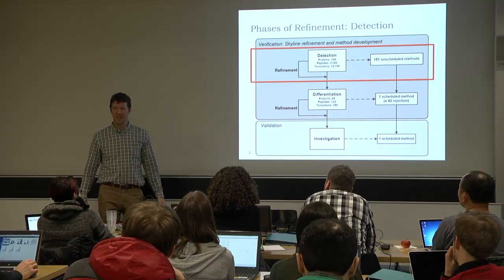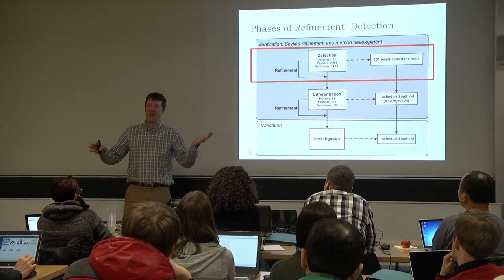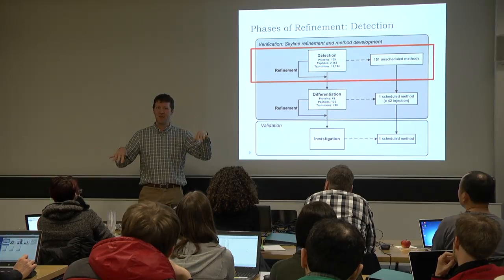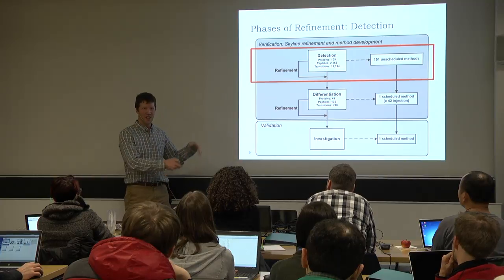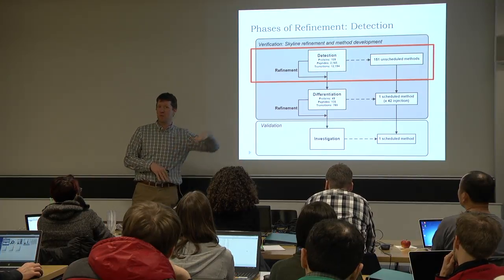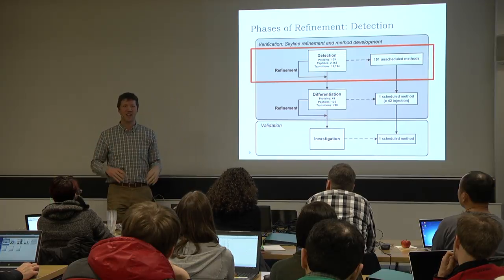It's probably not different. So we hypothesize, well, those things are just going to fall out. And what if it doesn't fall out? What if there's this amazing difference? Well, it's just like a gel, right? Okay, now you have an amazing difference, and you go, wow, this peptide's the biomarker, and you order the synthetic, and the synthetic says, nope, the peptide's way over here. And whoa, what was I looking at?